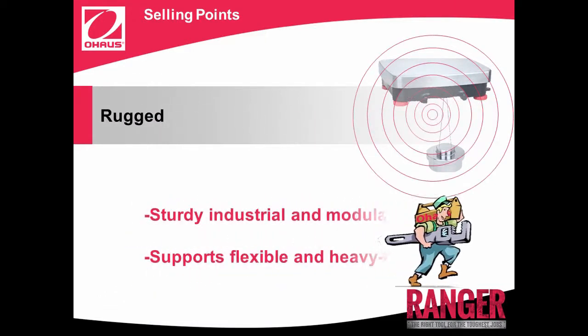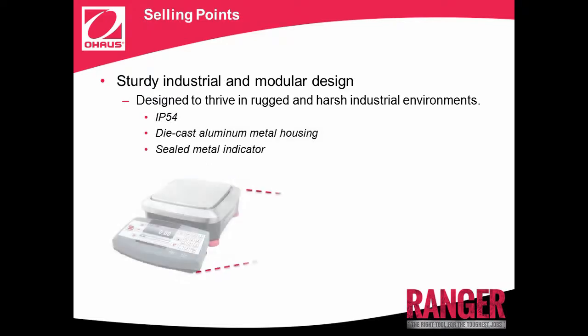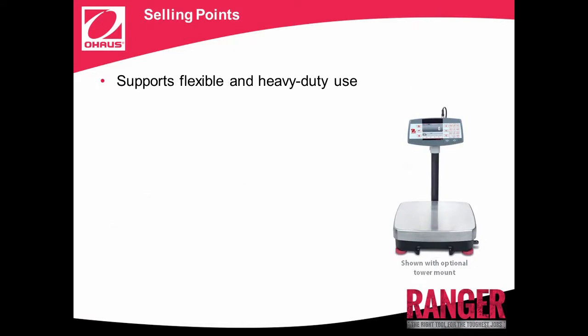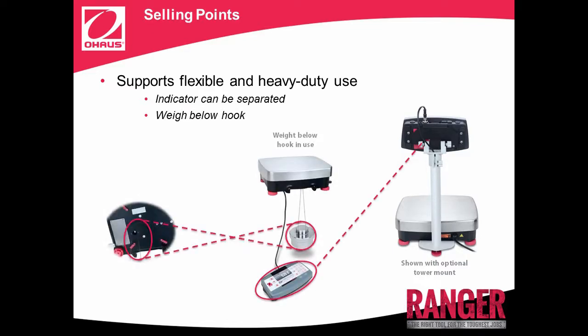Rugged, with a sturdy industrial and modular design that supports flexible and heavy-duty use. Need a scale that can hold up even in the toughest conditions? Ranger 7000 has an IP54 die-cast sealed metal indicator housing, ensuring its accurate and long-term operation in even the most demanding industrial environments. The indicator can be separated from the platform and mounted to the wall or bench with the optional mounting kit accessory, allowing you to customize the placement of your scale based on the size and setup of your workstation. Additionally, a Weigh Below hook offers the functionality to perform specific gravity tests or weigh items that cannot be easily placed on the weighing platform.